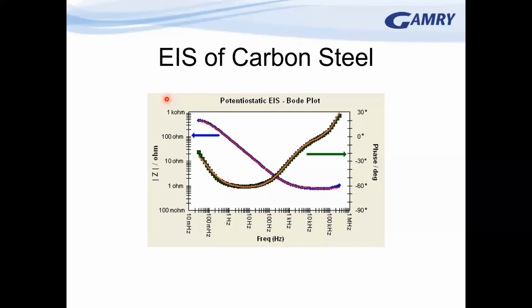Yeah, I guess so. You want to find a linear region. In truth, a lot of the experiments don't exhibit that linear region around zero, so you're going to have to draw a line that's a tangent to the curved part. It really applies to the point where the currents are small, so the point where you pass through zero. But if you have a linear region that starts around zero on one side of the zero point, I think you can safely use that as your starting point or your tangent.